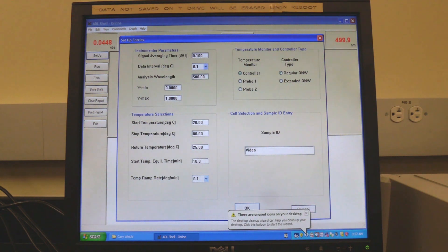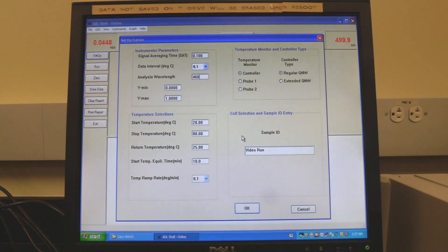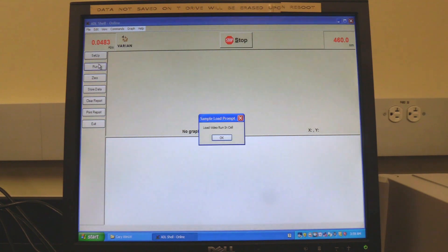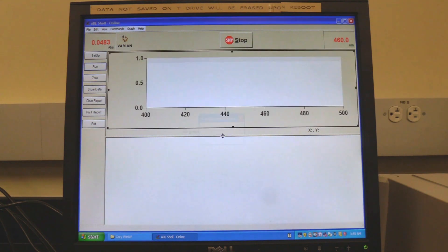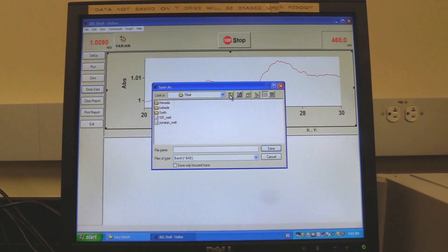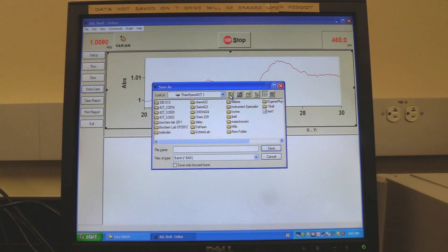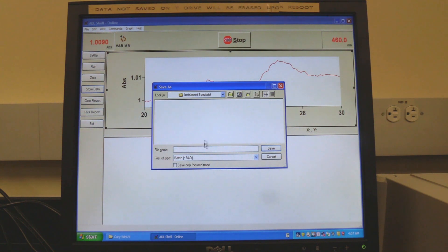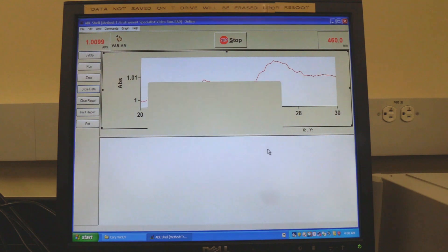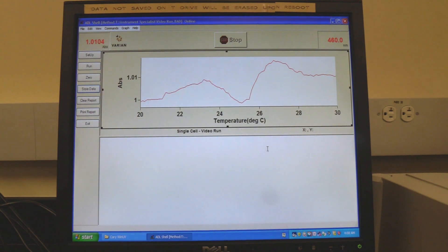In Cell Selection and Sample ID Entry, select Single Cell and name the sample. Click OK to set the setup parameters. Click on Run. Equilibration time will start. Wait for the run to finish. The spectrum will appear. Click on Store Data. The software will prompt the operator to save, as shown in the video. Find the appropriate folder, name the file, and click on Save.